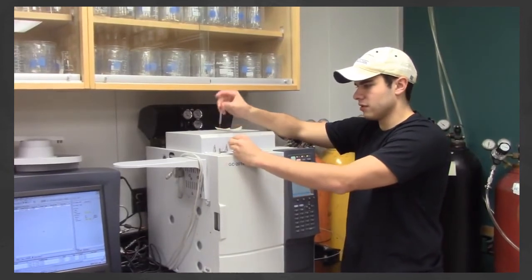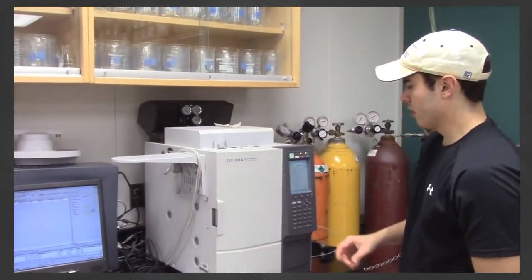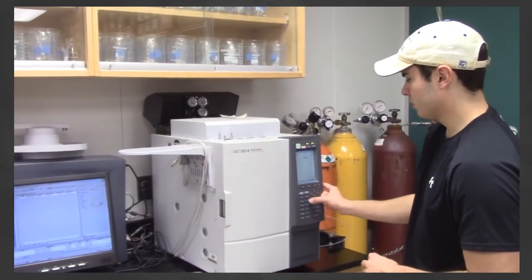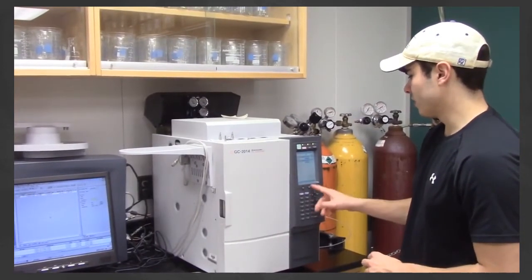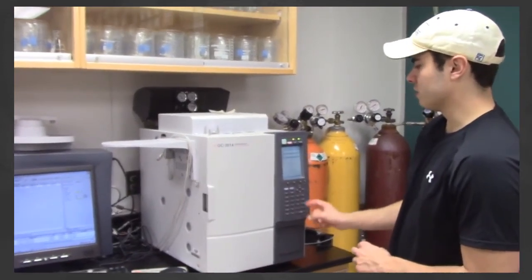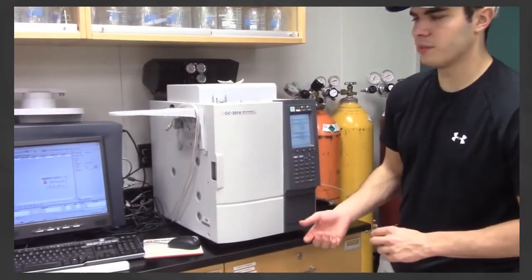Alright. Once it's in there, we're going to click start on here. And then we immediately have to go to injector and change the temperature. Just go to set. Set line config, and then we're going to go to line 1 and click enter, and then click return. And now your sample is running.